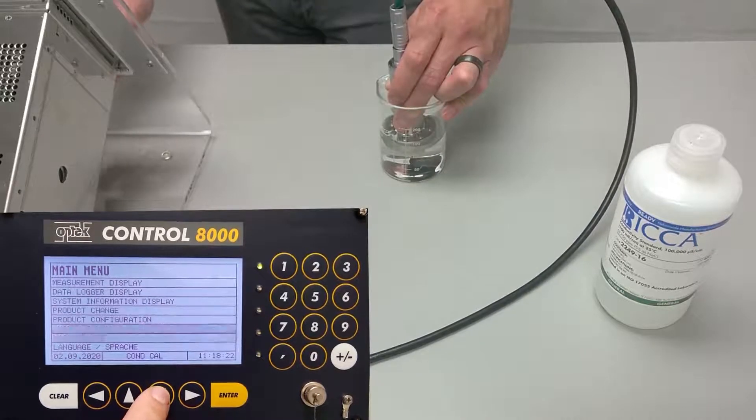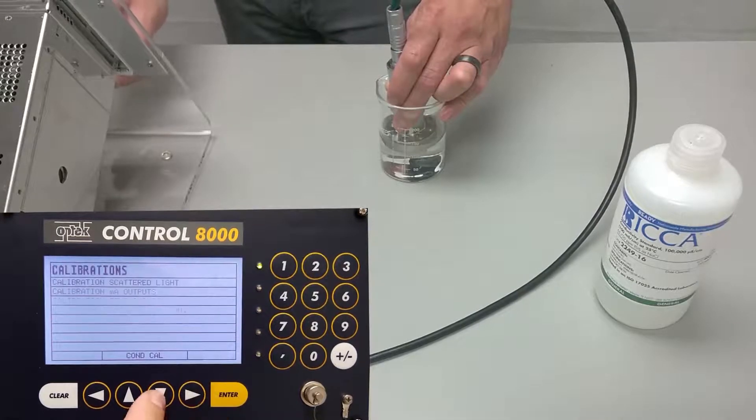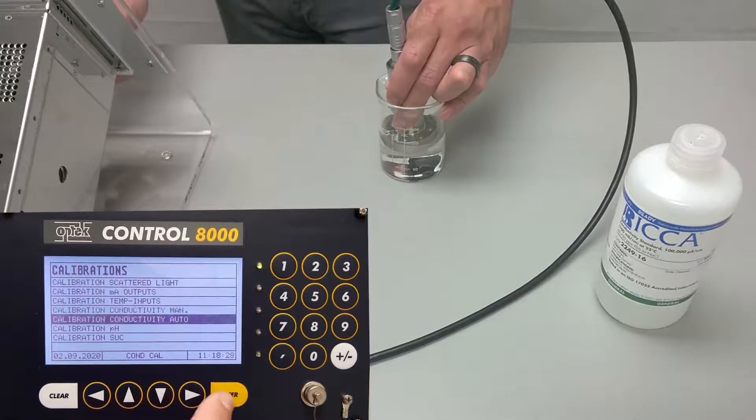Scroll down to maintenance and press enter. Scroll down to calibrations, then to calibration conductivity auto.